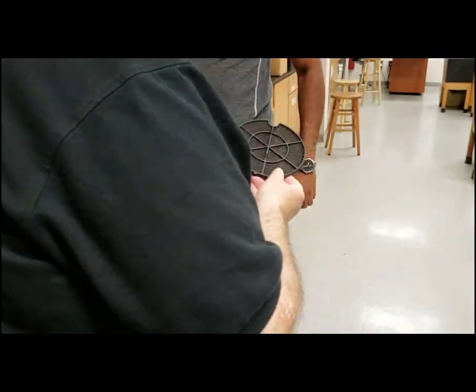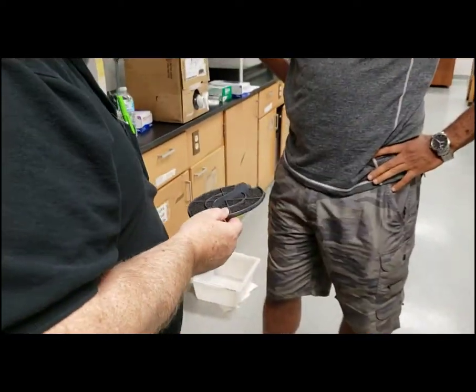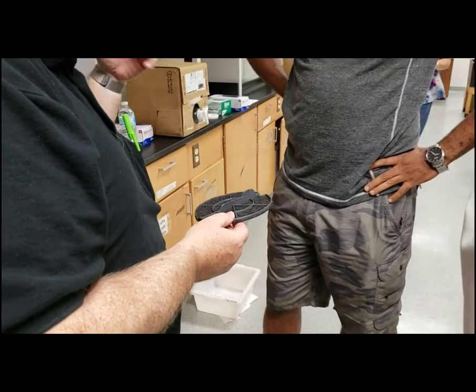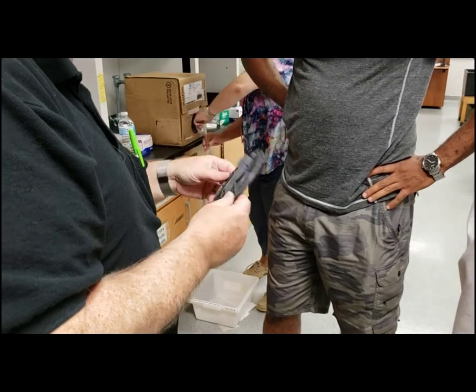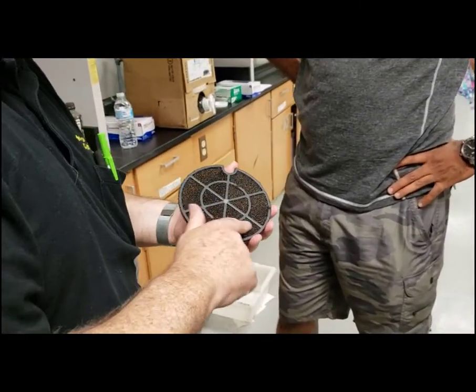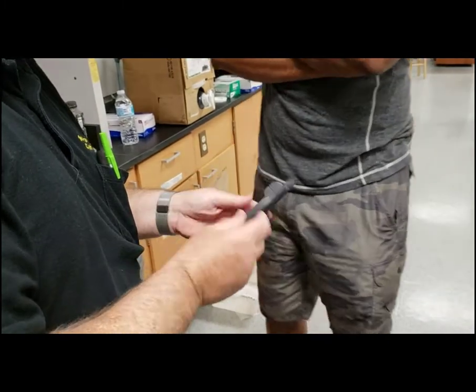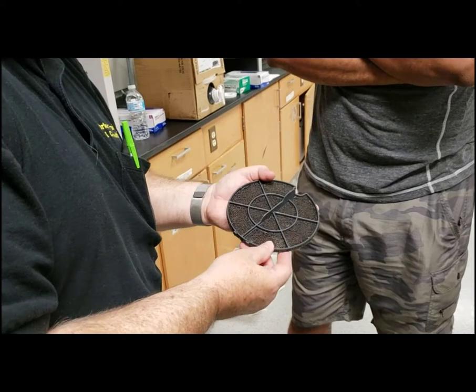So this is what's filtering all the air that's going into the instrument. Remember, this instrument is air cooled, so it's very important that the airflow is not choked off. There's a carbon filter. So this is what the filter should be: nice, gray, shiny. And then as it starts to get dirty, it's going to dull. This is in good shape.